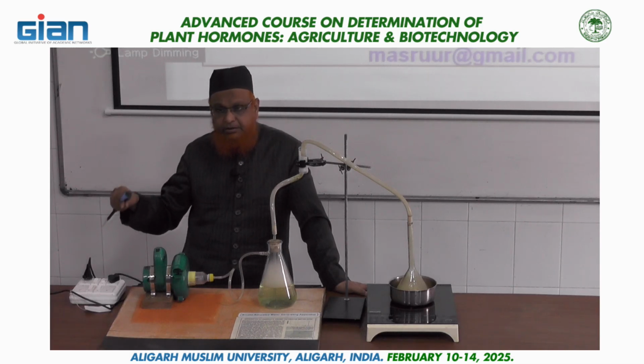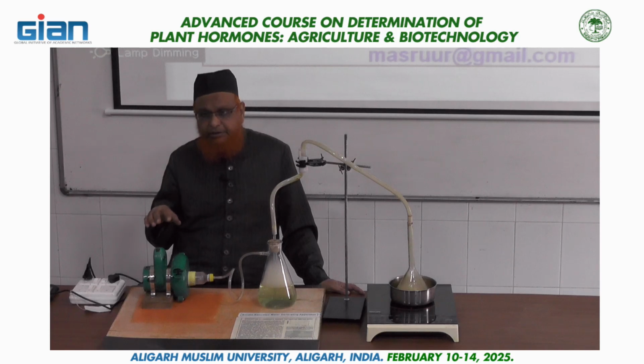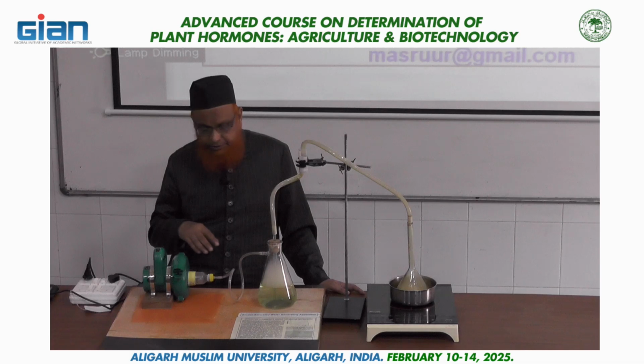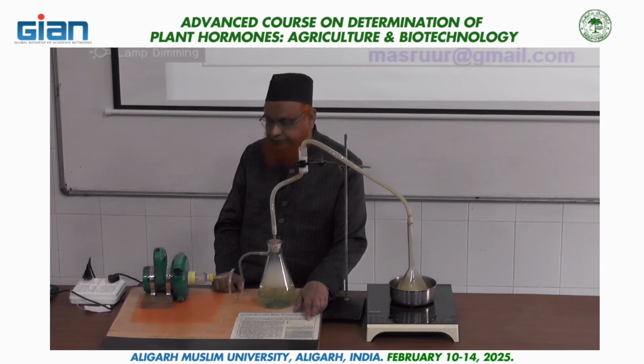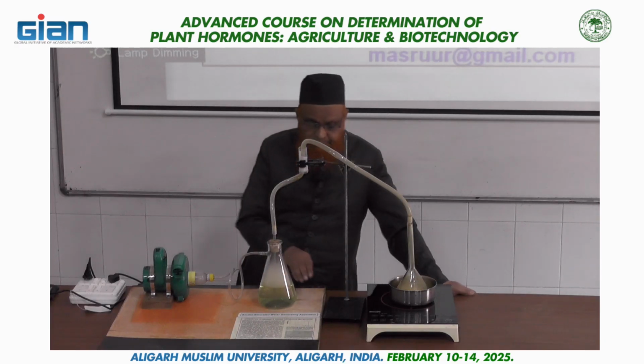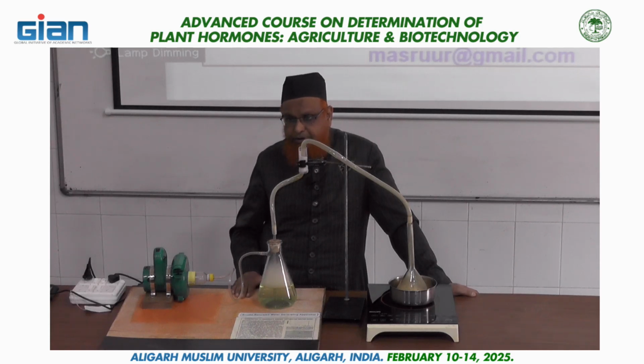optical density at 430 nanometers, right? Because what is the optimum maxima? This is the reading where the maximum OD comes. So we have to read all the readings at 430 nanometers. In this you will find a graph. After 5 minutes, 10 minutes, the optical density will increase. A time will come when there will be no increase of dissolving of smoke in water, and this will be fully yellow in color. Okay? No change in color will happen after this time. So at this time, you will get SSW, smoke saturated water.